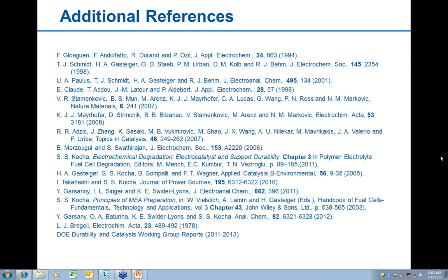Yannick, any other comments? That's correct, and what I've also been doing lately is using a laminar flow fume hood. You have an airflow on top of the electrode while it's drying. That seems to be helping when you're drying the electrodes.